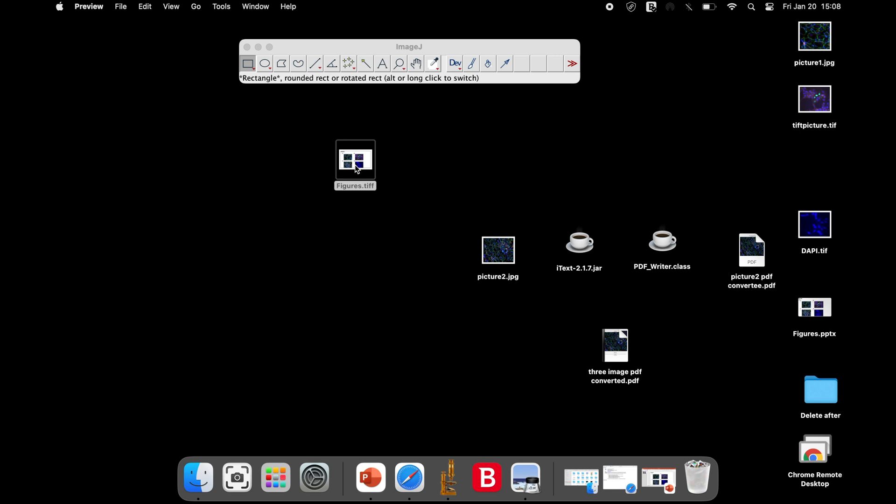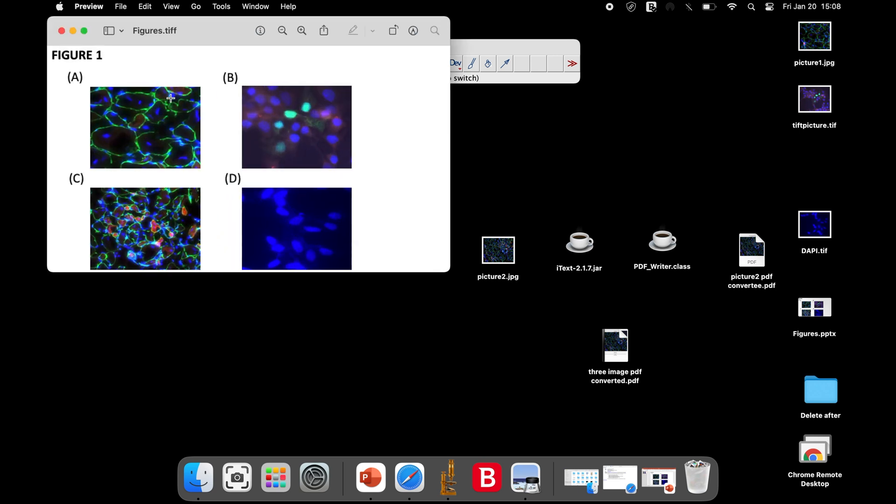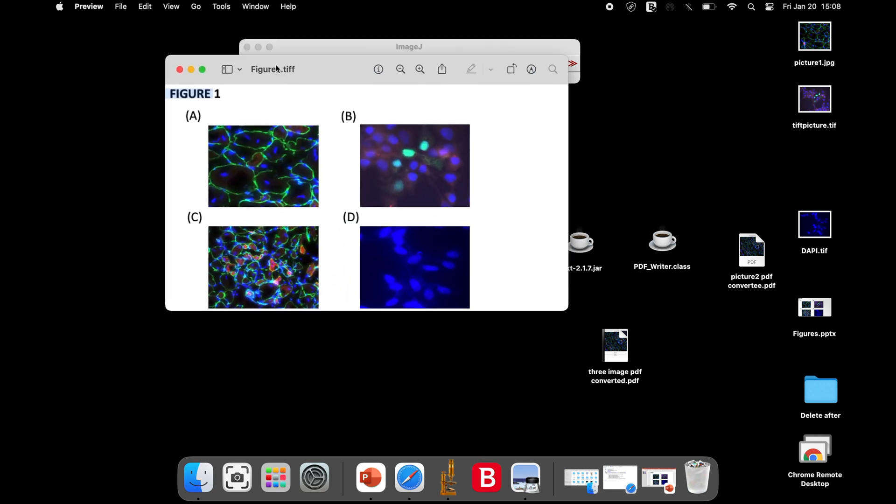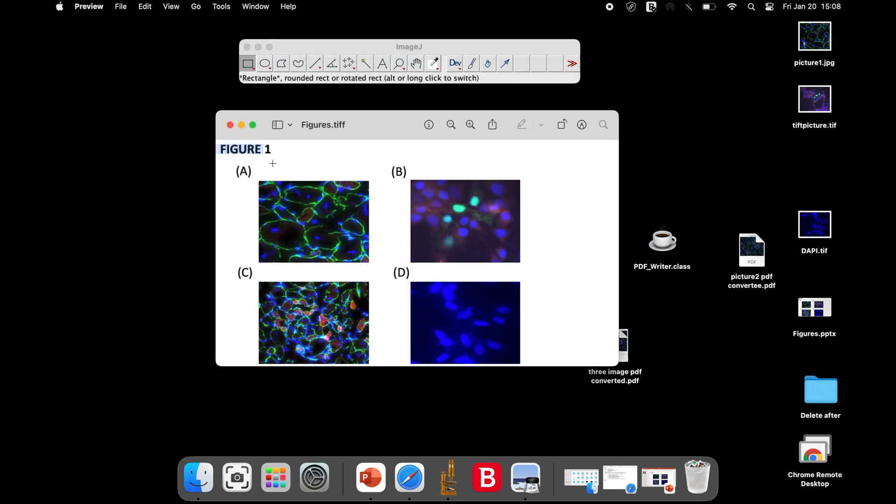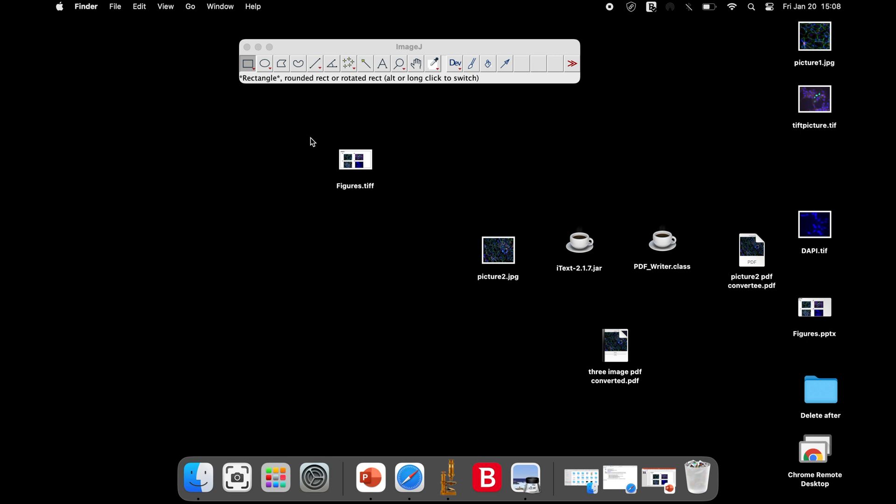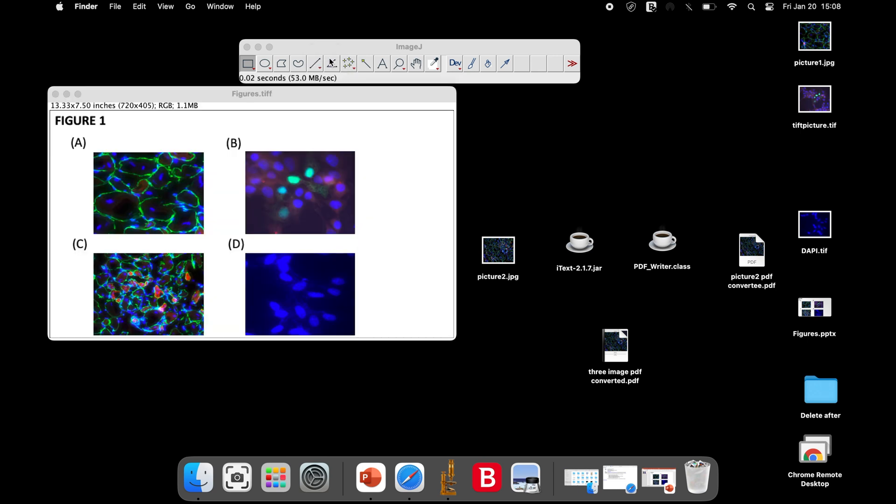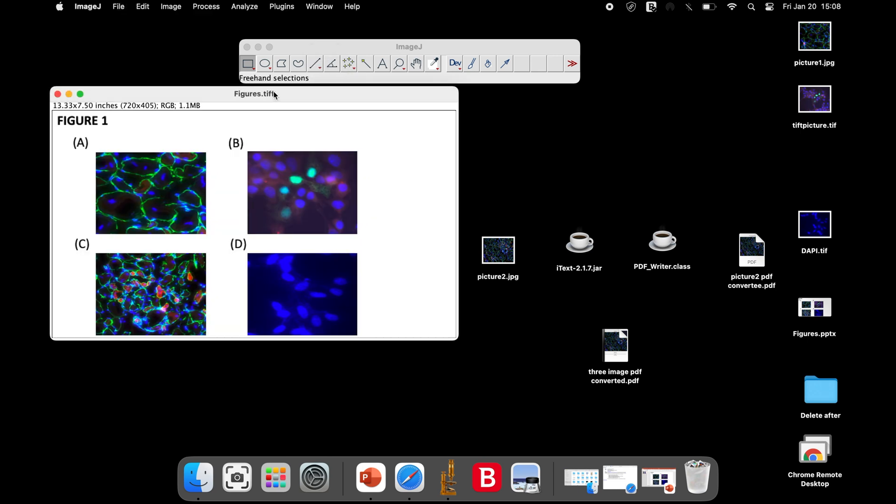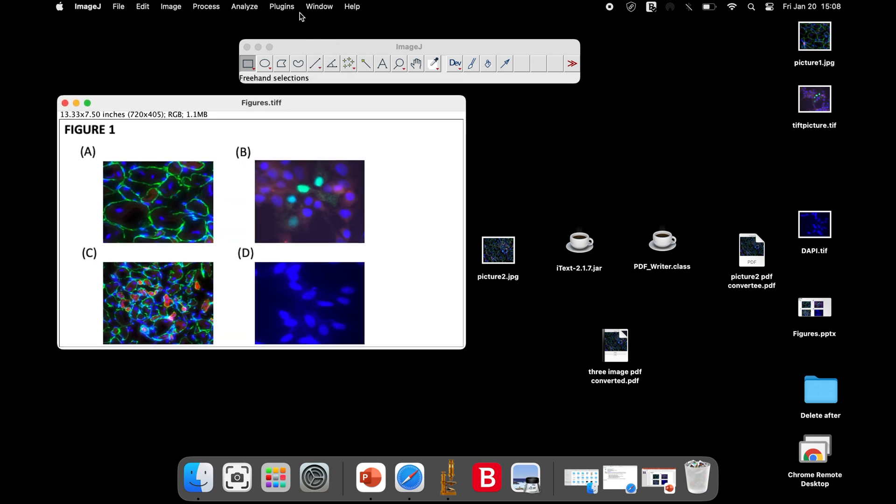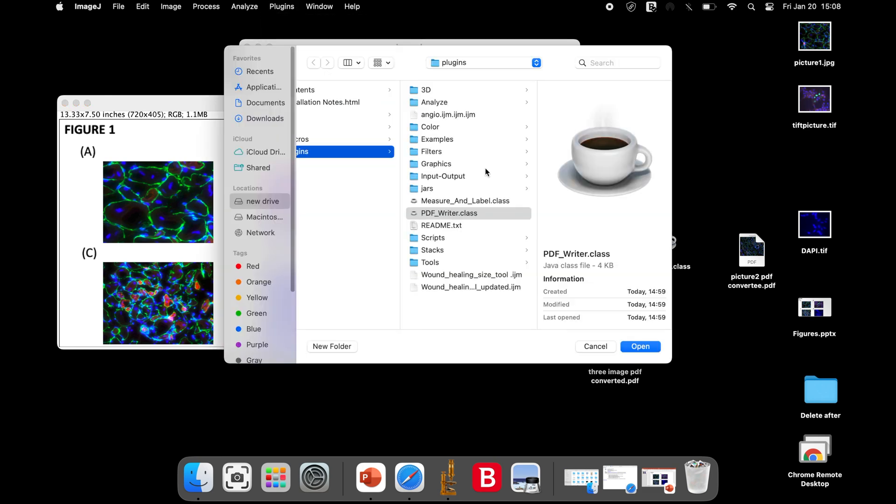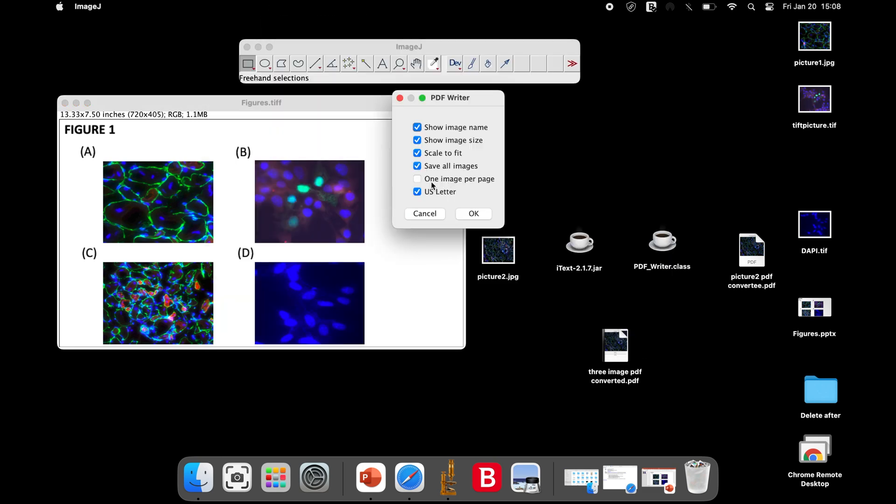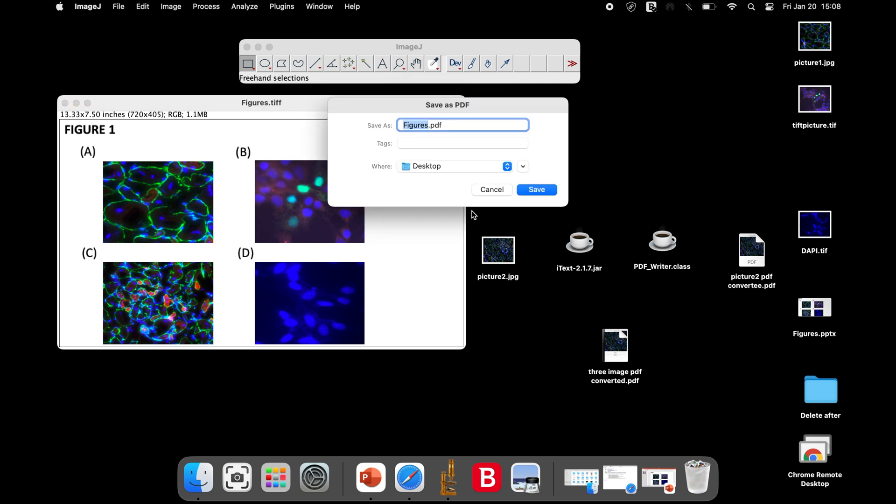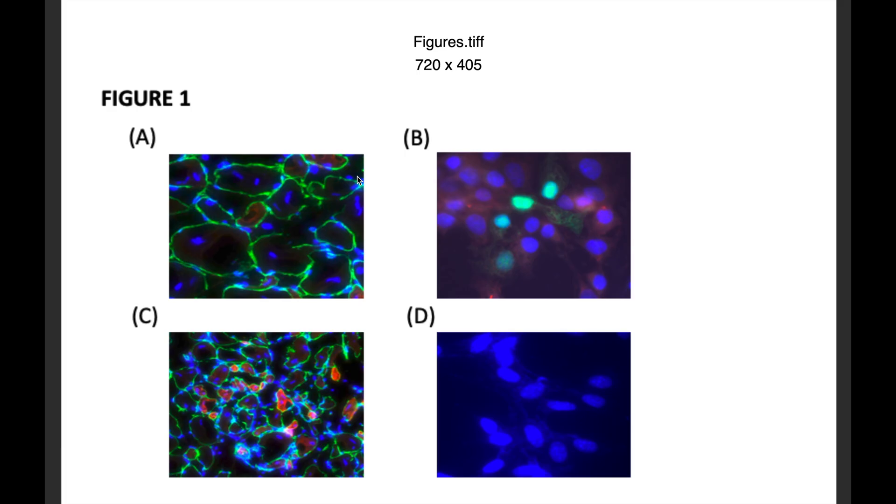Now, we have the image version of the PowerPoint image. Open the image using ImageJ software and follow the same procedure to convert the TIFF image into a PDF format. Once saved, the image is ready in a PDF format.